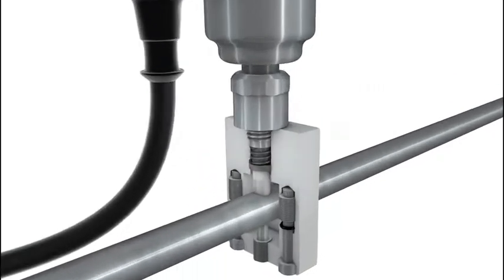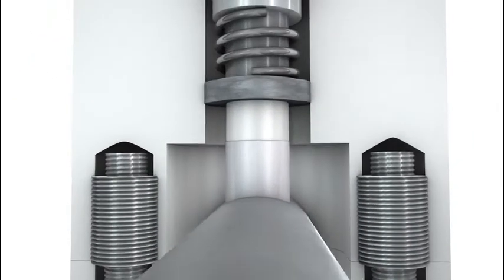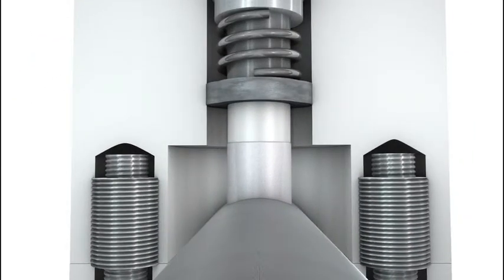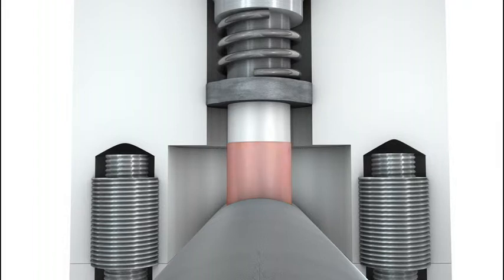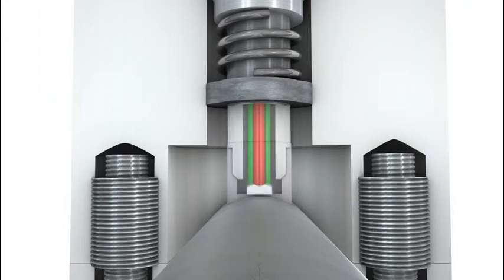This is how the measuring insert looks from the inside. The temperature sensor consists of a silver tip shaped to fit the pipe. The PT100 element is situated as close as possible on top of the pipe. Silver is used here because of its excellent heat transfer properties.